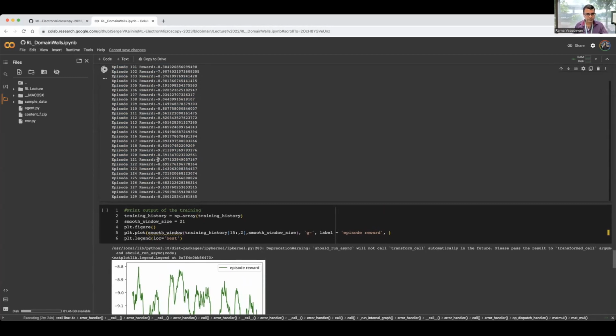So it suggests that at least in that case, it found some decent set of actions. Another way that we can improve this is we can learn, instead of a single policy, distributions over policies. And we can leverage variational methods to be able to find the gradients there, and high performance computing resources to be able to collect more transitions to be able to estimate those gradients. So those are all advanced computational topics, but these are the kinds of things that are required in order for us to be able to deploy reinforcement learning in microscope operations.